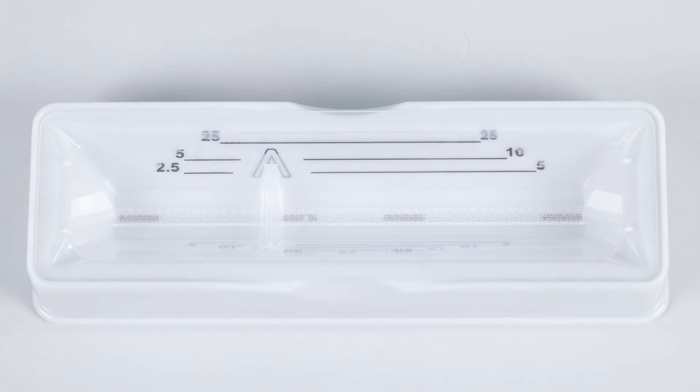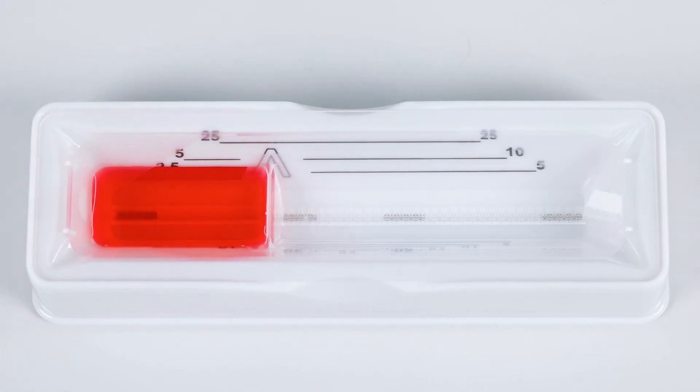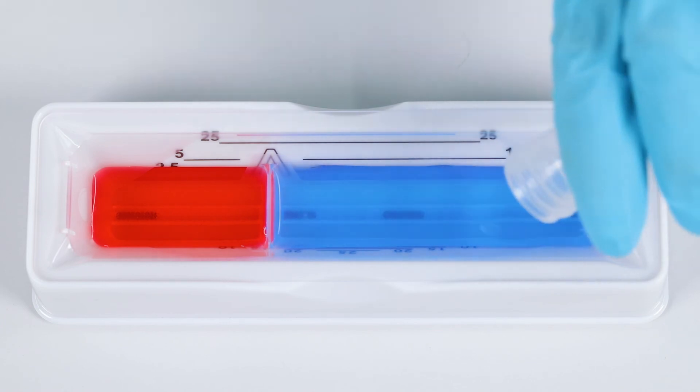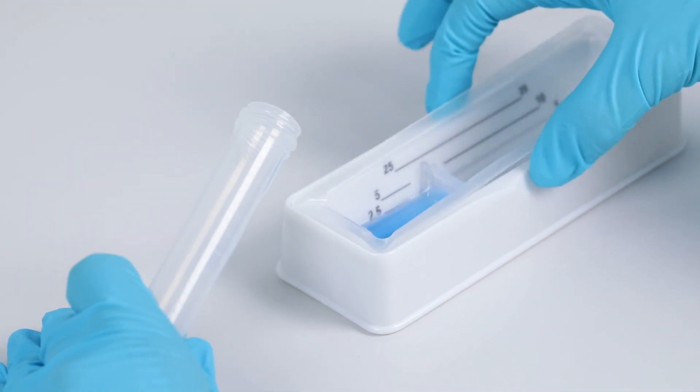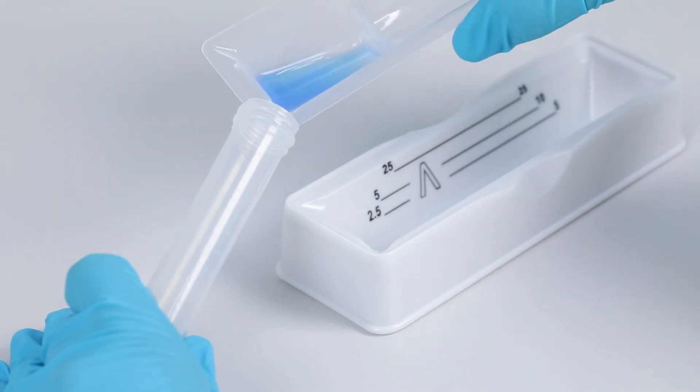The unique design refracts light so graduations below the fluid surface become invisible, making it simple to fill the exact reagent volume desired. Molded into each reservoir corner, pour back spouts precisely control liquid flow and allow you to neatly return excess fluid to a source container, resulting in less wasted reagent.